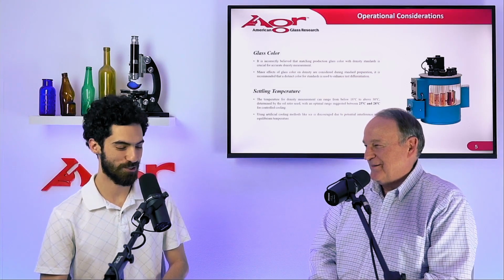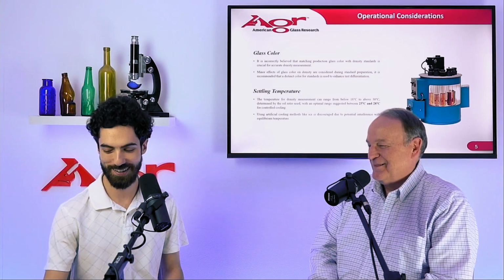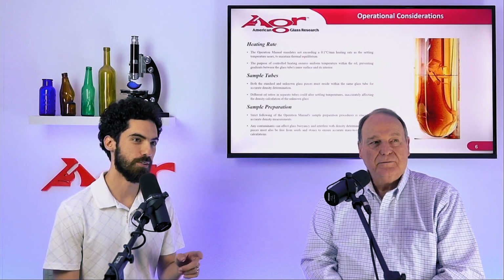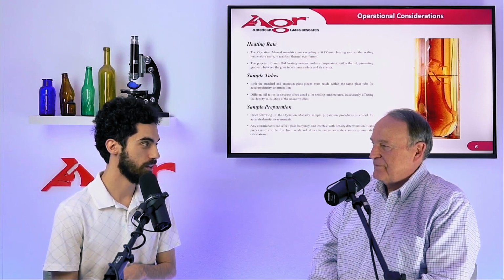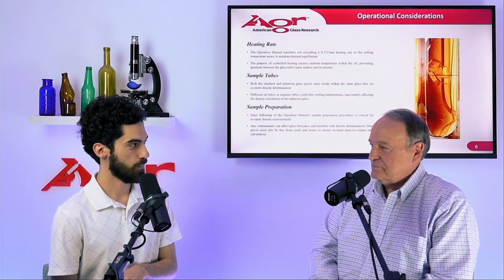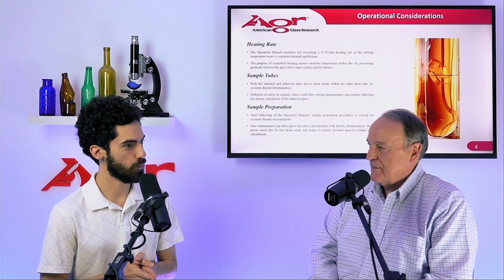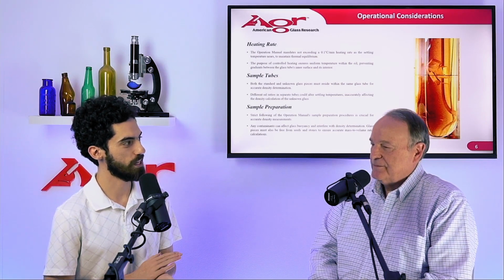Please don't do that. Just use the cooling tool. Okay, so all good points on the settling temperature. Now, in relation to that, we have the heating rate. You have that heating element inside, and there's a pretty rigid standard for what we allow for the heating rate.